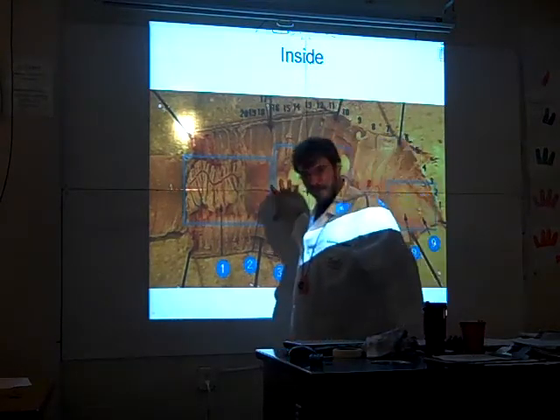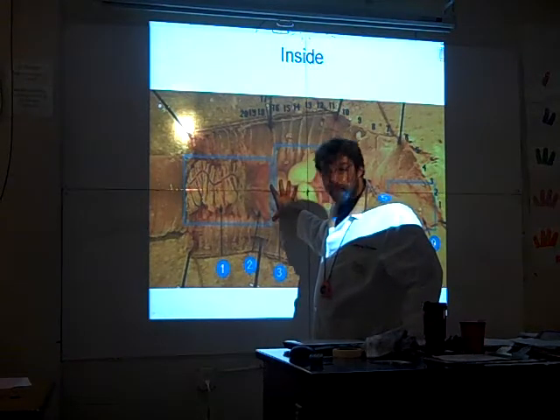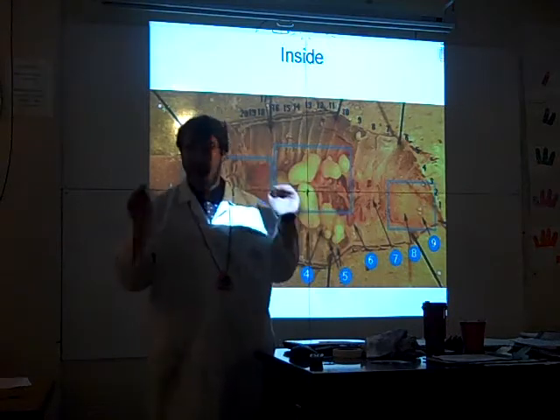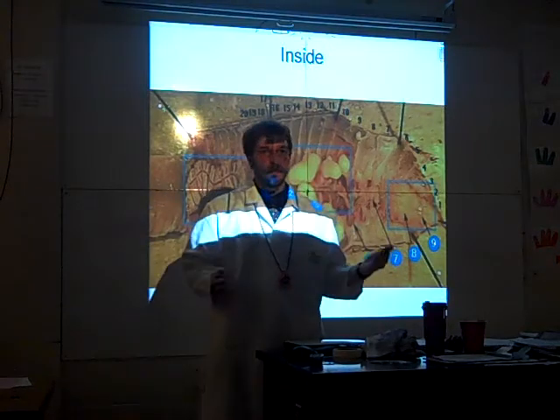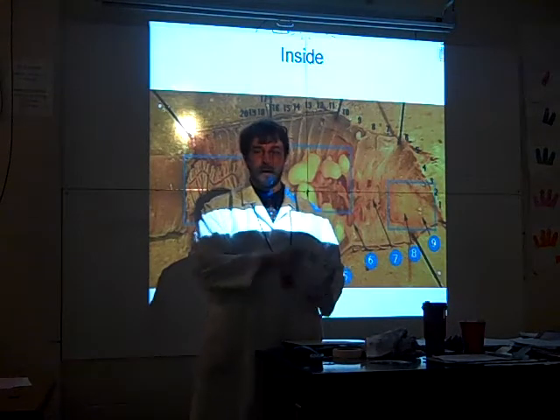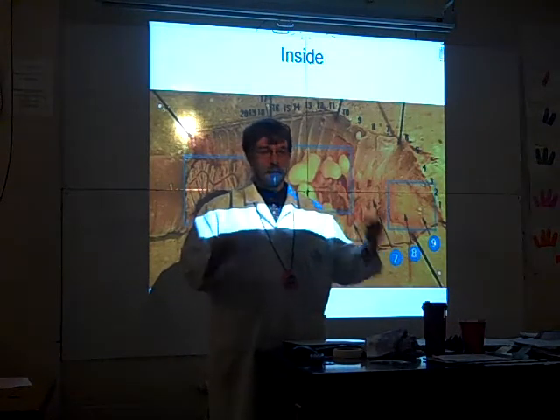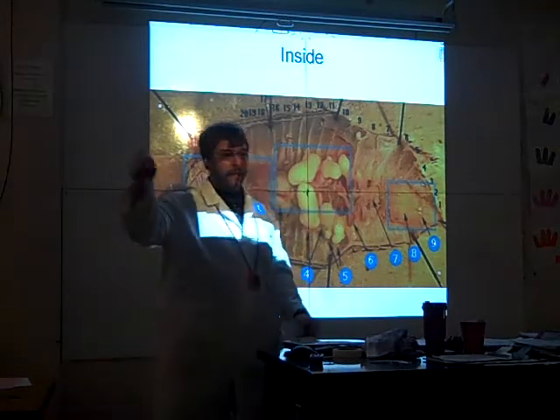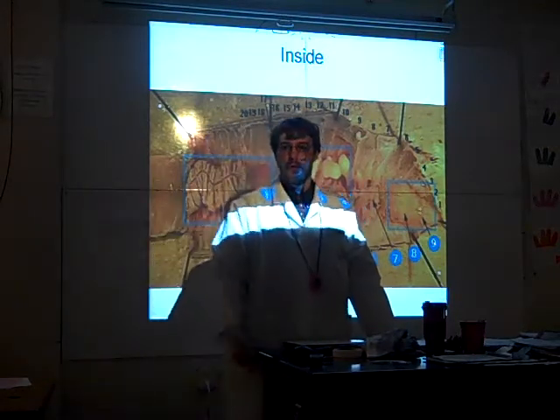The procedures, guess where they are? In the lab manual. Everybody needs to get one out. The reason is one person gets the procedures with the steps, the other person opens up to the page with the diagram, so you've got everything to look at. The procedures walk you through identifying these organs and filling out the packets that you guys got out. Make sure you're doing that all together.